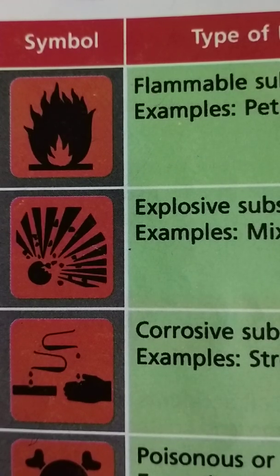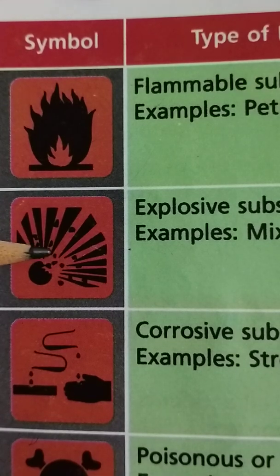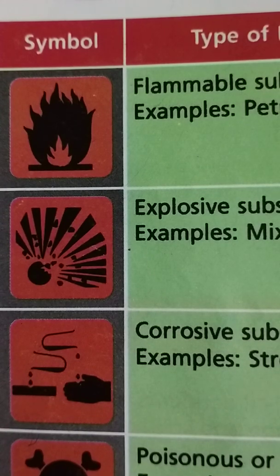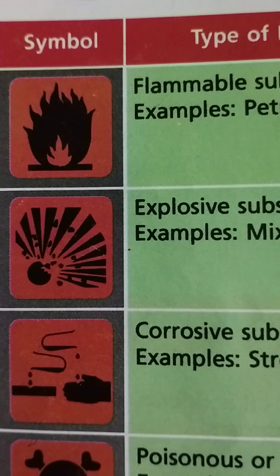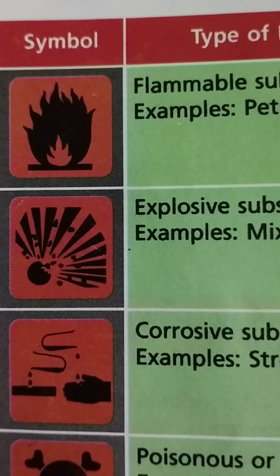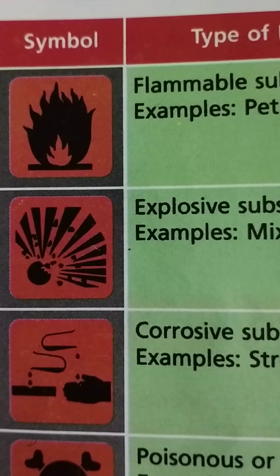The second symbol is used for explosive substances. An explosive substance is a reactive substance that contains a great amount of potential energy that can produce an explosion if released suddenly, accompanied by the production of light, heat, sound, and pressure. Examples include a mixture of hydrogen and air, and a common example is an aerosol can. Explosive substances usually explode when heated or lit, so we must use them according to instructions and keep them under low temperature.